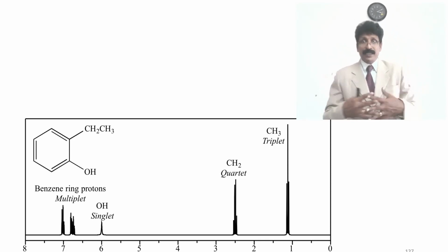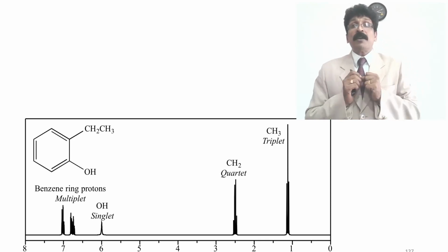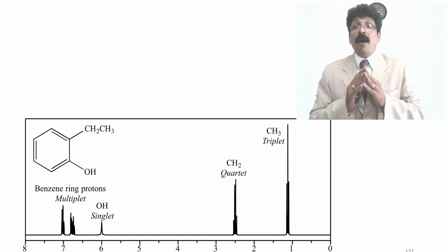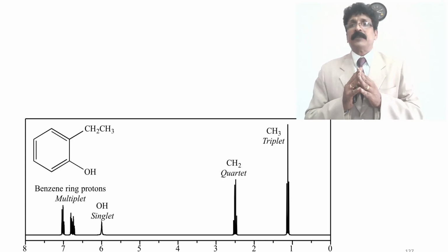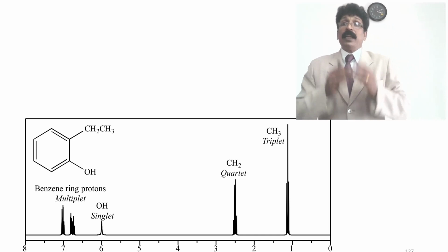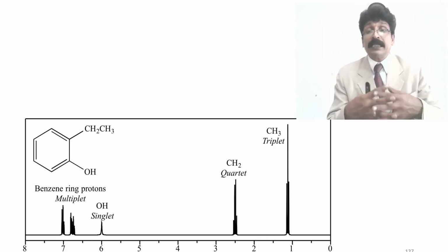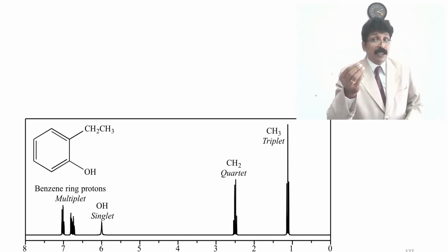So that is the confirmation. So with one instrument, by means of getting the spectrum, we cannot confirm the structural elucidation. For all the instruments which we have studied for elucidation of a structure, comparison is needed. I am just sharing my small knowledge which I have.